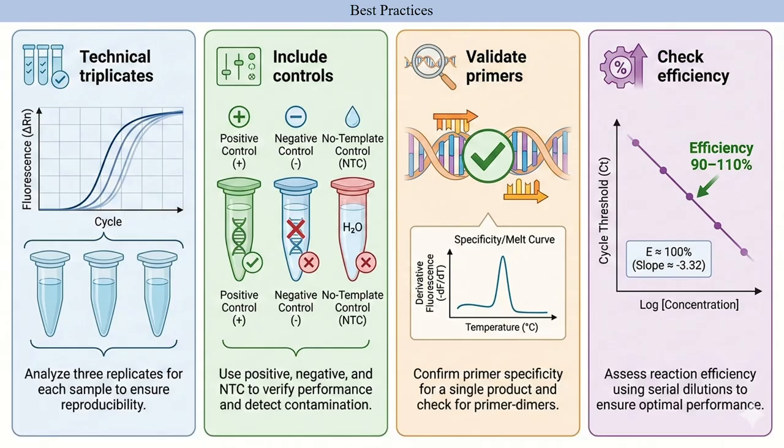Always validate primers, check efficiency, include controls, run replicates, and document everything. Consistency across runs is essential for comparative studies.